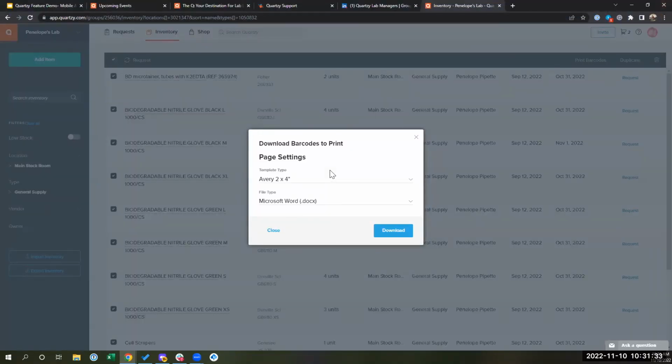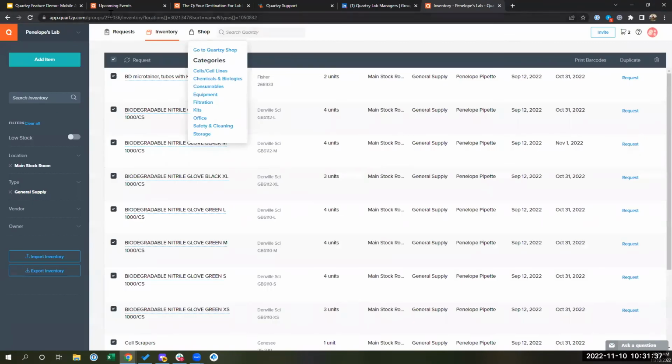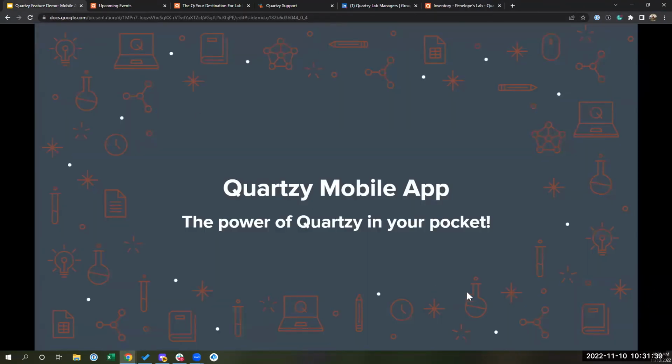Great. I'm glad it works live. It's what it's supposed to do. Yeah, it basically just goes down the list top to bottom, whatever you've got on the screen. Then of course you can pick the first one and then skip the second one and just select that list to print whatever items you need, but it should follow that top to bottom order.